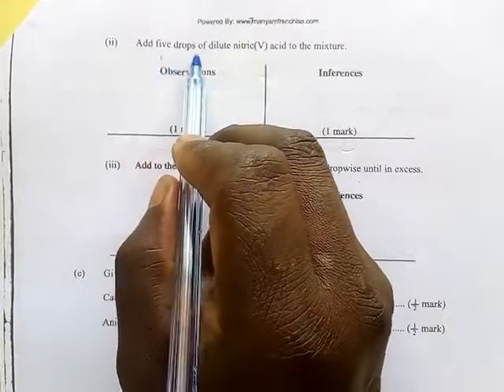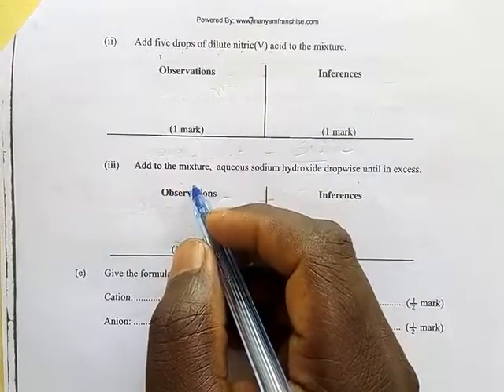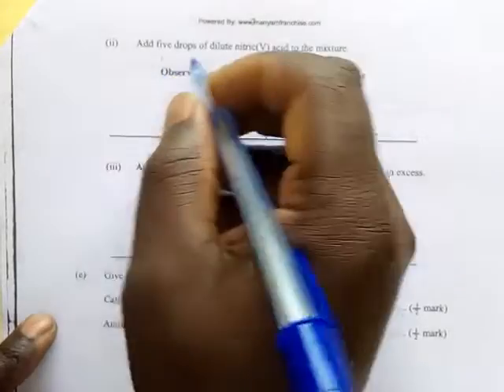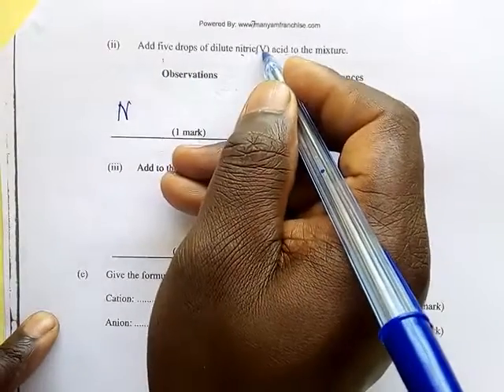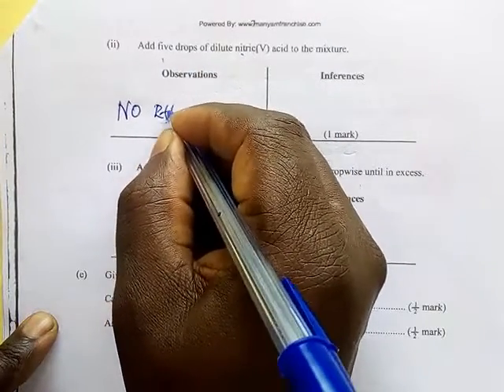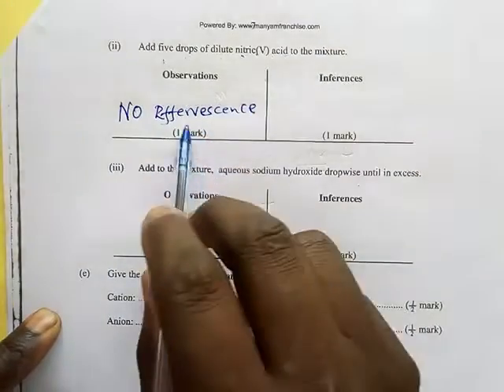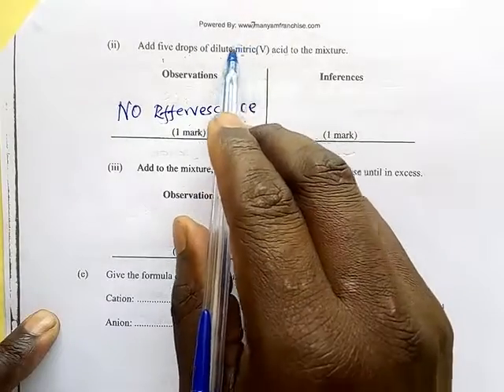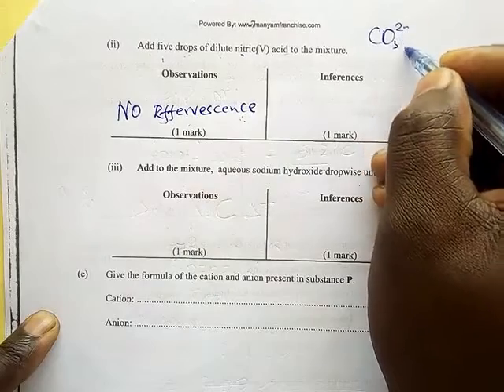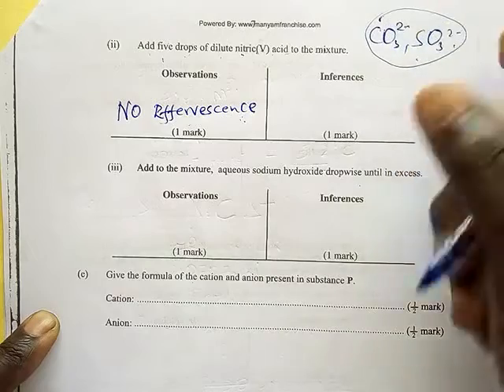Add 5 drops of dilute nitric acid to the mixture above. What will be the observation? That is no effervescence. If there is no effervescence when we add dilute nitric acid, then it means the carbonate and the sulfite are absent, because when you add an acid, they form effervescence.